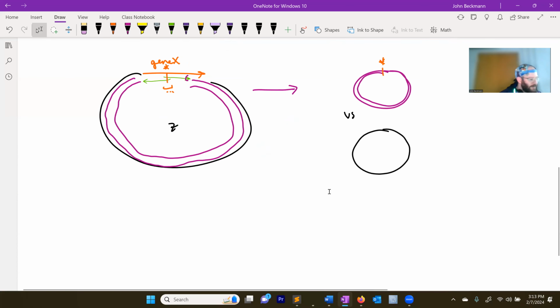So let's go through the steps now. We'll go a little bit more in detail in this process. And then at the very end, I'll walk you through how to design the primers.